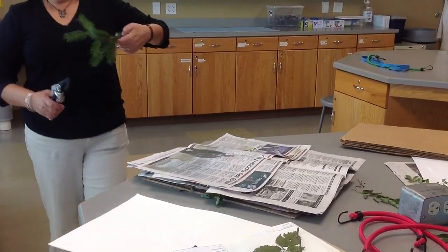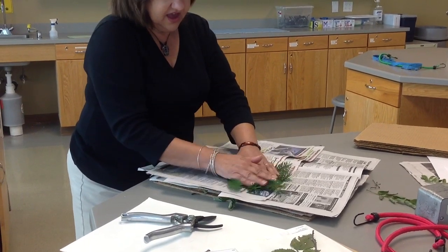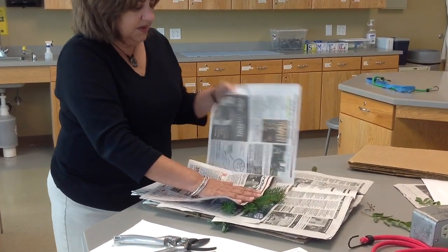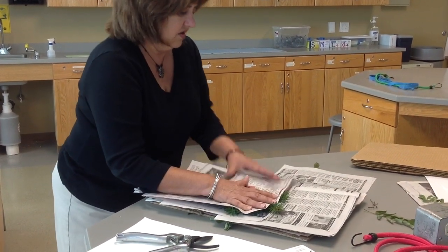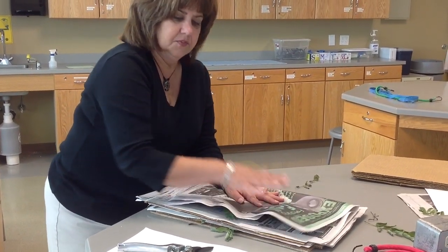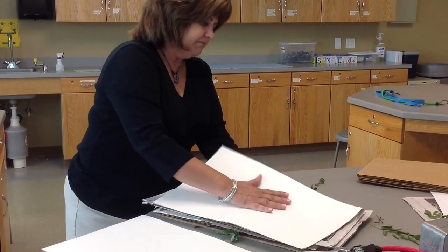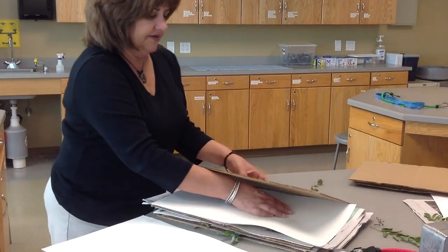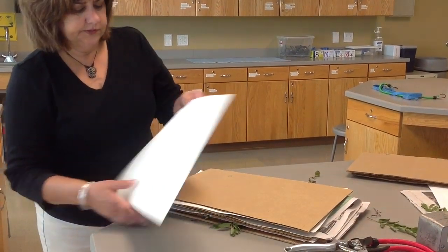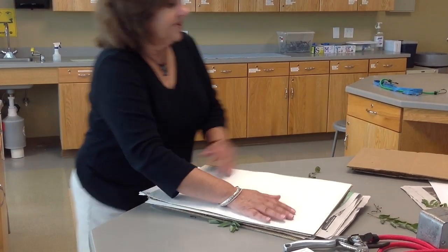Here I have a conifer, which is an easy sample — I just try to spread it out and press down. With conifers, you have to keep a careful eye on them because you reach a point where the leaves begin to drop. So watch these for how long you leave them in the press before you take them out and start to glue them onto the sample sheet. Then add another felt, another cardboard, another felt, and another layer of newspaper.